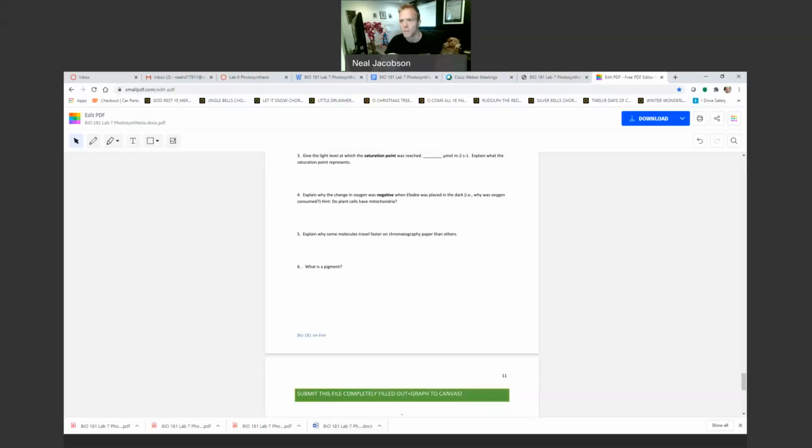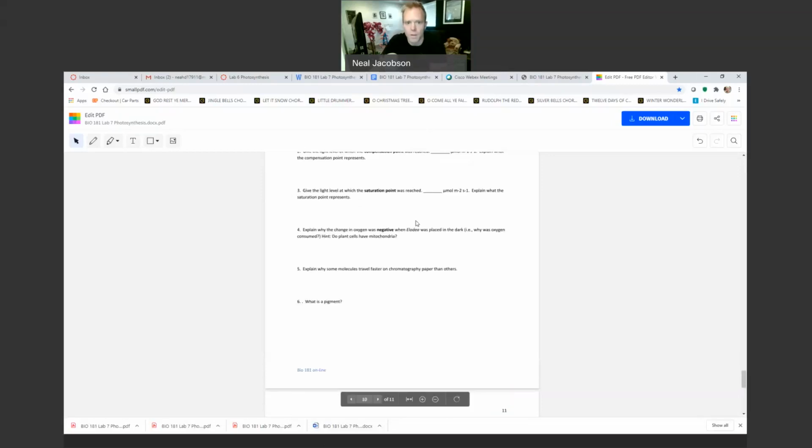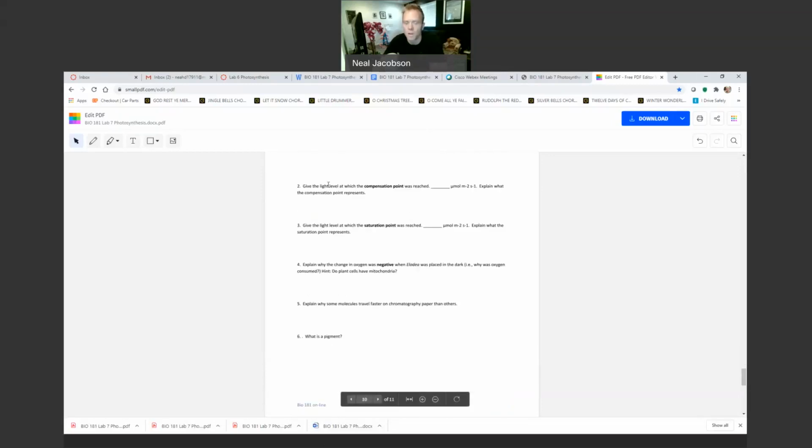Okay, so I'm back. Let's make sure I'm sharing the screen. So we're answering this question: give the level of light at which compensation is reached. What it's asking for is the independent variable's measurement where the amount of oxygen being used up by cell respiration in the mitochondria equals that being produced by the chloroplast in photosynthesis.